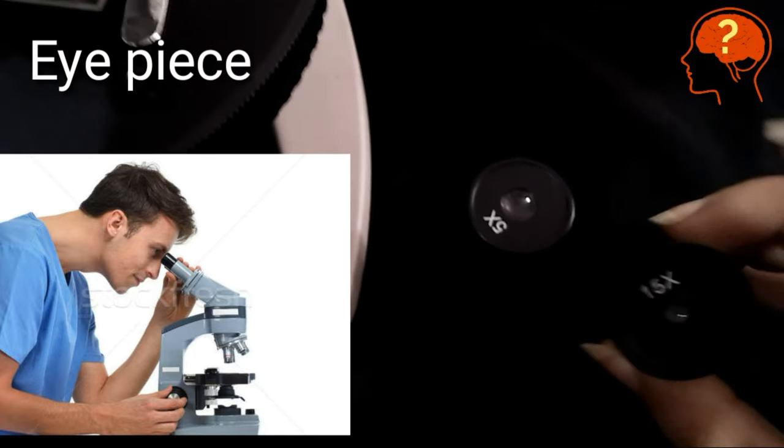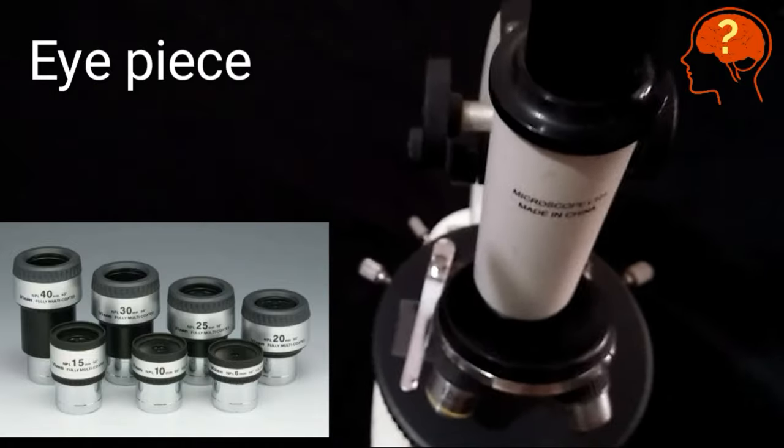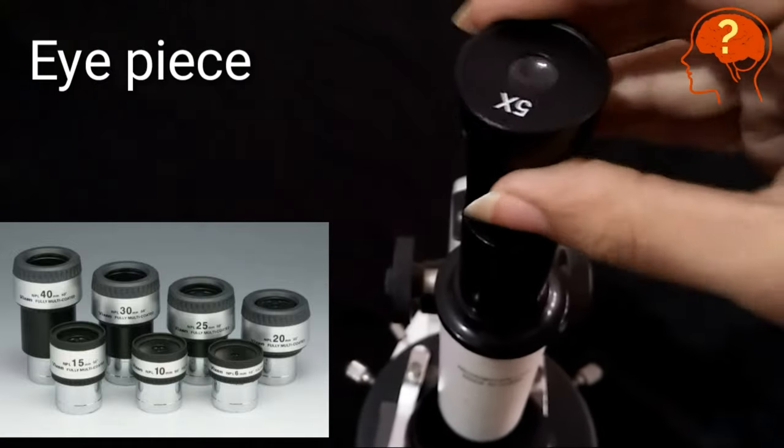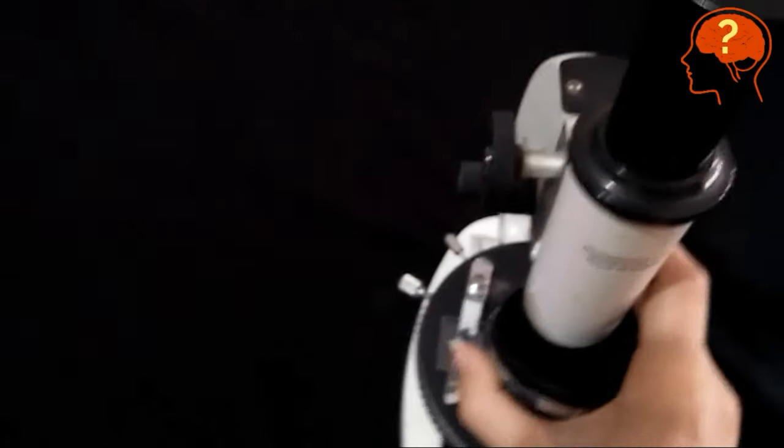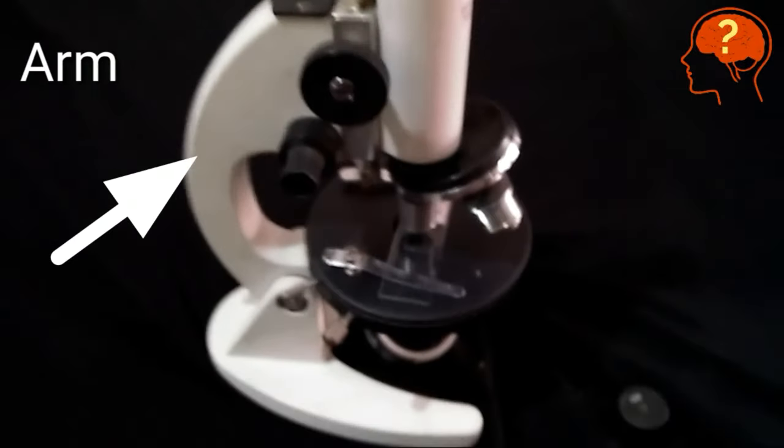They are also present in different magnifications like 5x, 10x, and 15x. This structure is called the arm of the microscope.